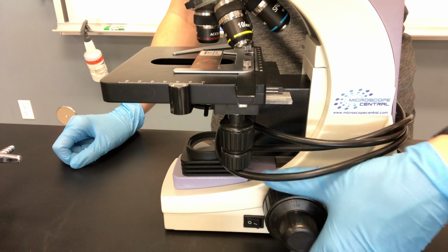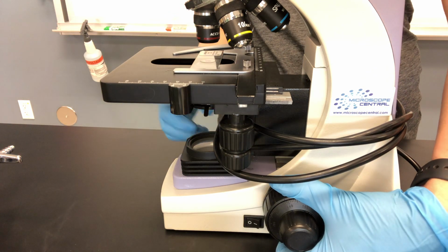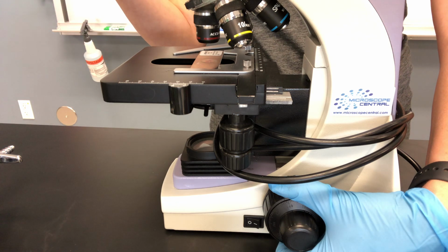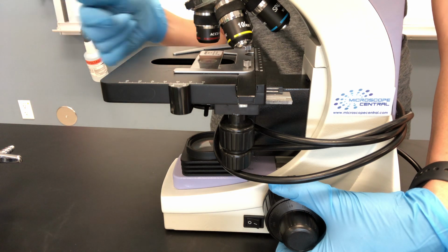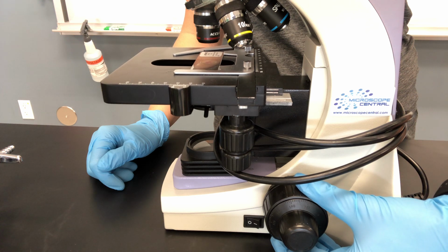So this is the coarse focus knob, and then the fine focus knob only moves the stage a little bit. I'm going to have everybody start with the coarse focus and the stage all the way up. Okay, so you have your specimen centered with our little stage knobs here. You're going to be looking into the eyepieces, and then with the stage all the way up, you're going to start slowly lowering the stage.